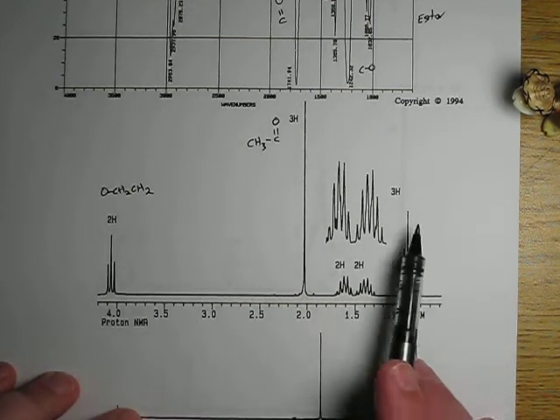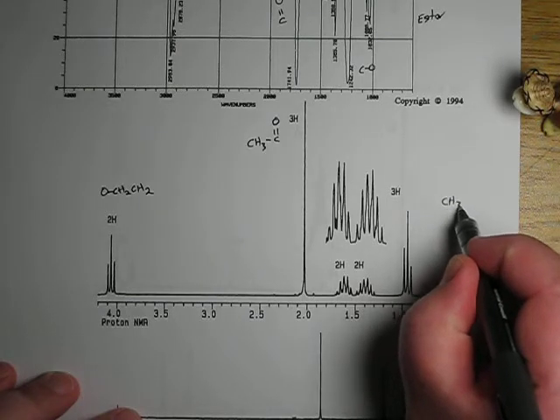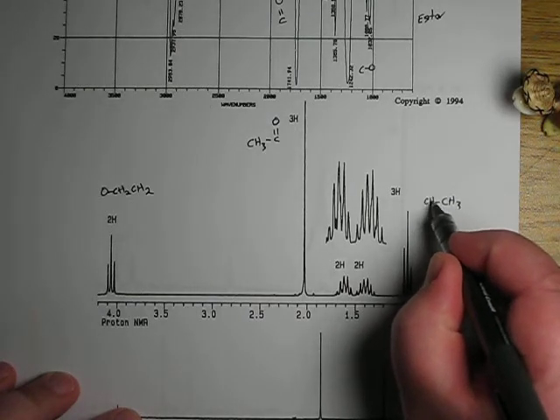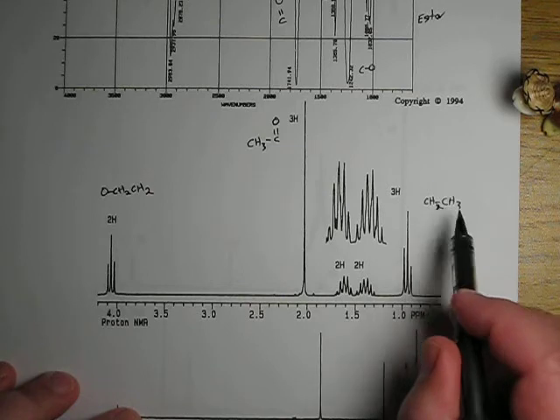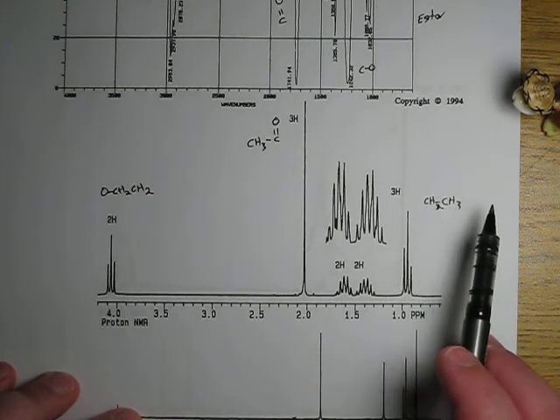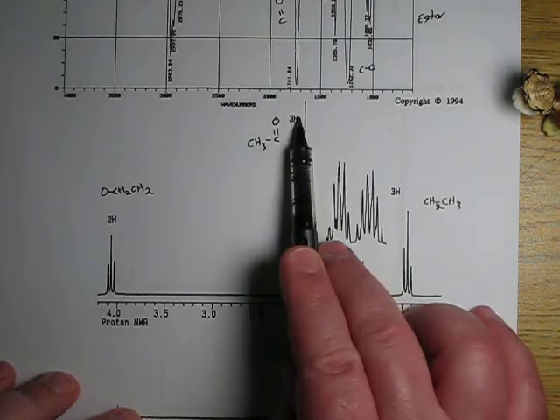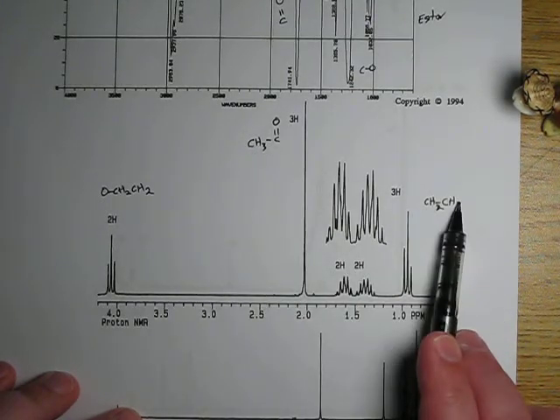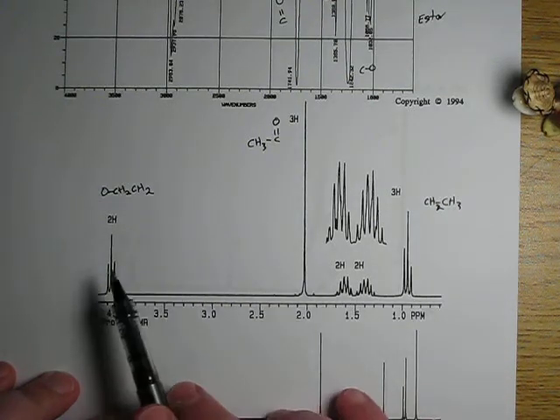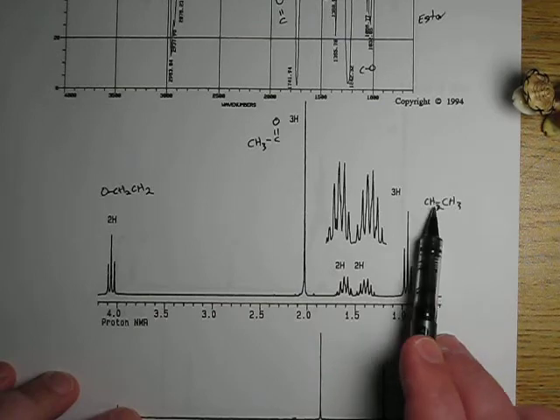So I know with my CH3 here, I have to have CH3 bonded to a CH2 because it's a triplet. So let's see. What do I have? Let me look at my pieces. 2 CH3s, and 1, 2, 3 CH2s.